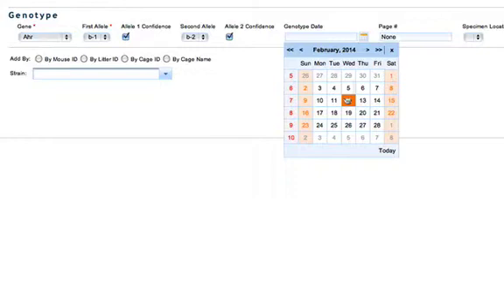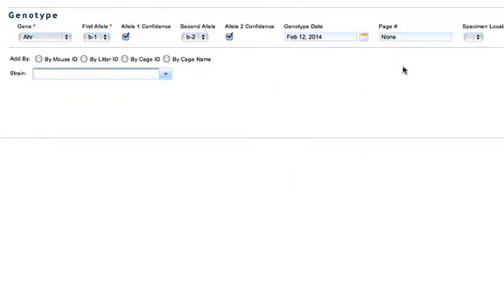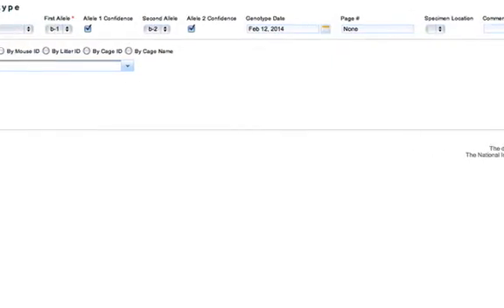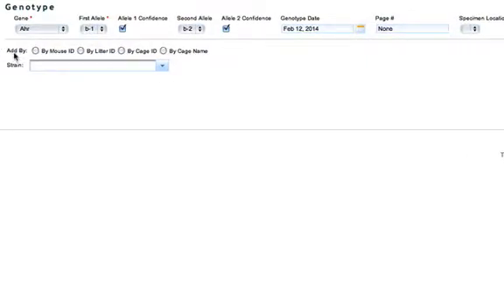You can enter the genotype date and the page number, specimen location, and comments if you choose to. Then select add by, so you can choose to add by mouse ID, litter ID, cage ID, or cage name.